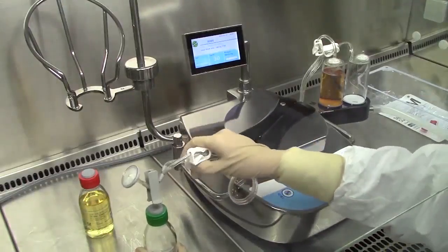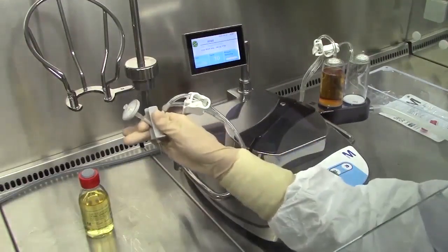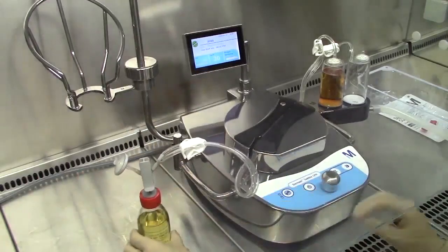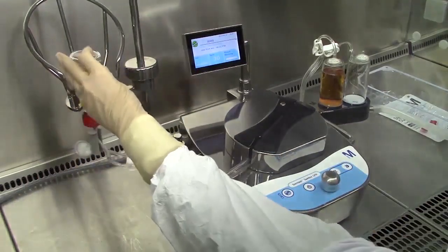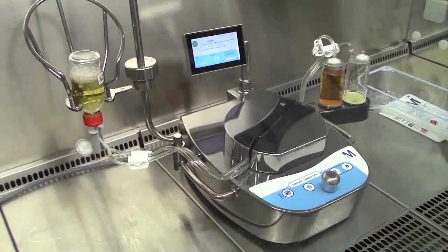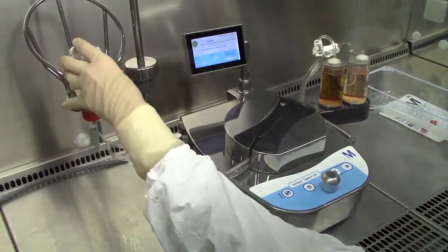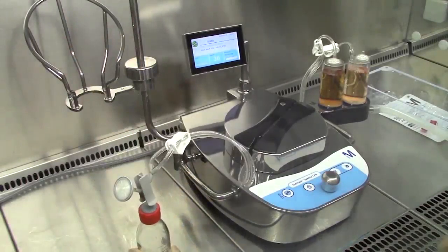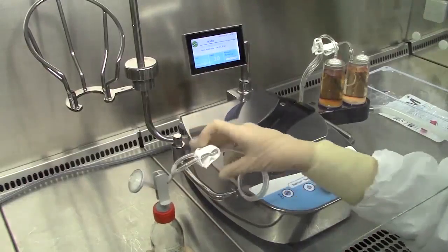Repeat the media filling step with a thioglycolate bottle on the second canister after clamping off the opposite tubing line so that the remaining empty canister can be filled with thioglycolate. Note that for thioglycolate, fill-in is done at a low speed, maximum 30, to ensure the aeration is minimal and media returns as quickly as possible to its double layer state. Stop the pump and open all clamps in order to equilibrate the pressure.